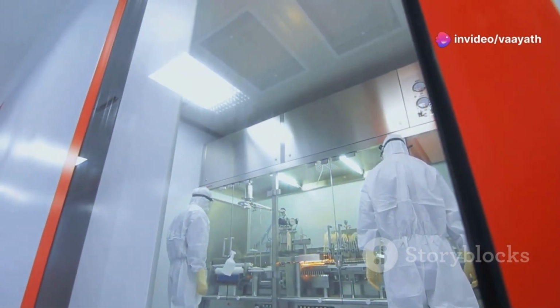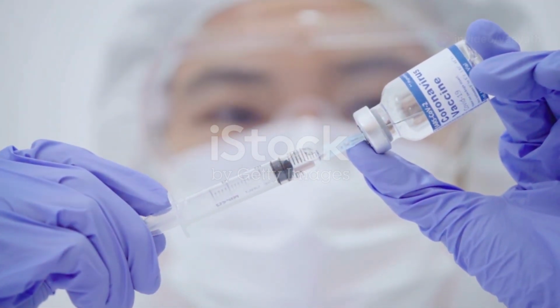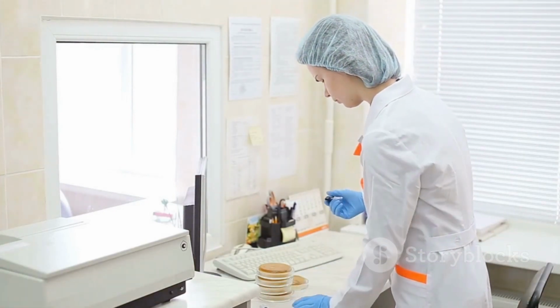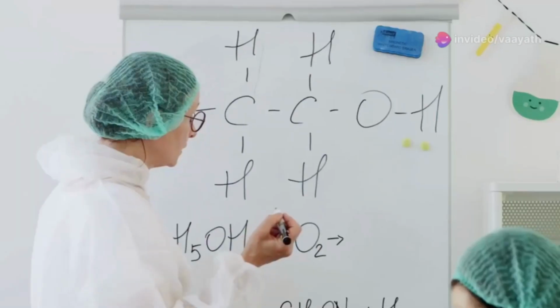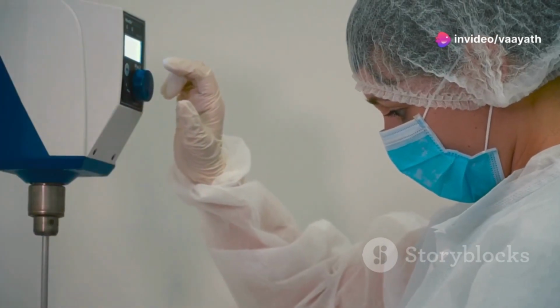Imagine a factory producing life-saving medicines. These medicines, injected directly into our bodies, must be completely sterile. This means absolutely no bacteria or other microbes can be present. But how do we guarantee this level of cleanliness? This is where media fill validation comes in.